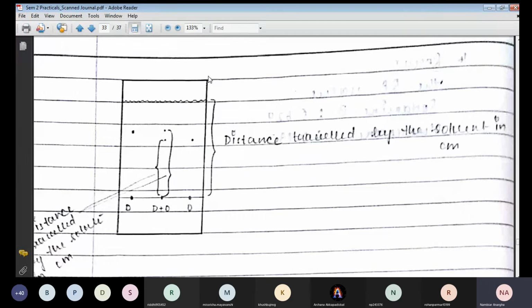We'll keep the TLC plate in the iodine chamber till we see light brownish colored spots, till that is evident to you. Till that time you will keep the TLC plate in that chamber. It takes a few seconds, like 60 to 75 seconds. And then once the spots are very much visible, which is bright yellow, or I mean either it is yellow, I'll not say yellow, it is almost light brownish colored.